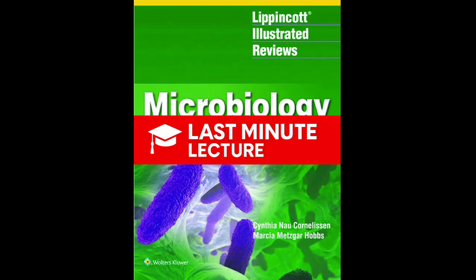And then there's the food itself, the media. The book breaks it down into enriched, selective, and differential. Right. Enriched is for the divas, the fastidious organisms. Like blood agar has sheep's blood, and lots of things grow on that. But some need more. They need chocolate agar. Which, I was very sad to learn, has no actual chocolate. A cruel trick, I know. It's just blood agar that's been heated. The heat pops the red blood cells open and releases extra nutrients.